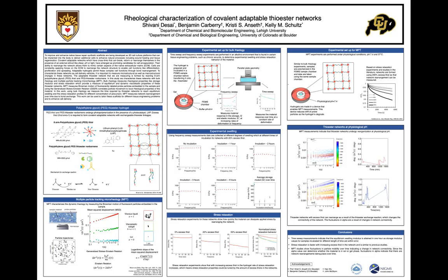And we measure storage modulus for samples which are incubated at pH 8.4 for different length of time. The data shows that the average storage modulus for samples which were incubated over 1 hour is within each other's error. Now we measure stress relaxation properties of the material.